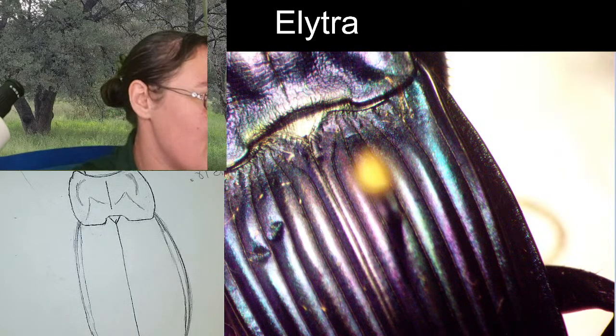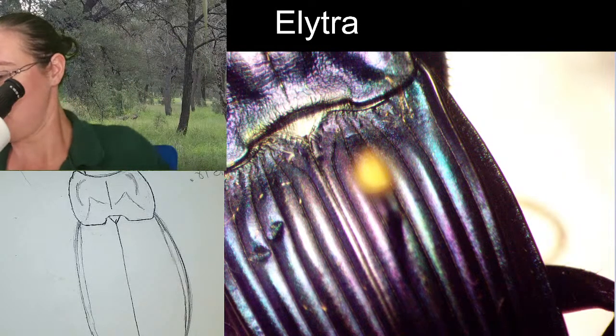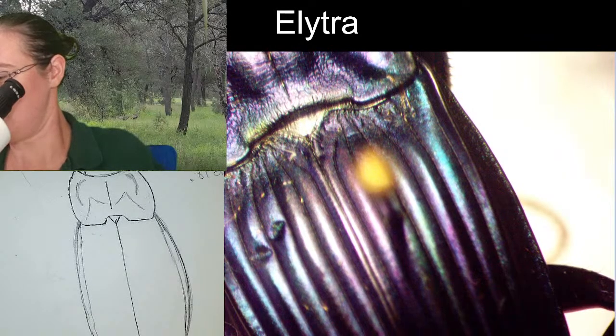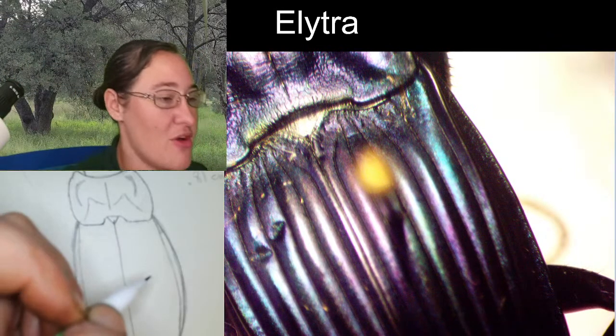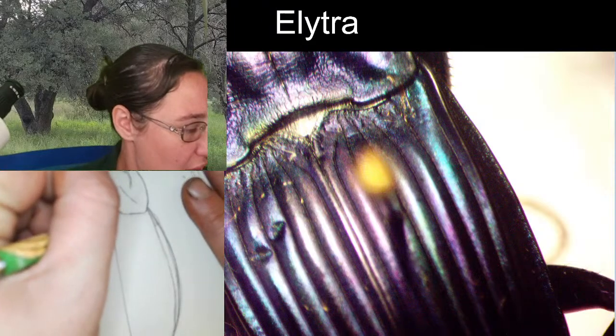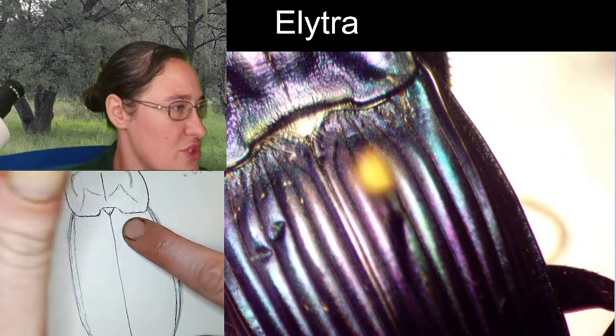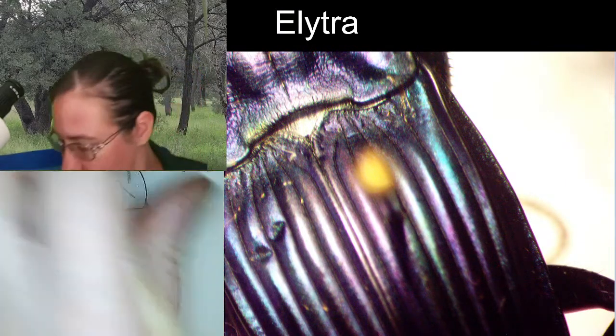All right, let's see. We've got 1, 2, 3, 4, 5, 6. There are 6 striations per elytron. All right, so there are 6 striations going down. If you'd like your sketch to be realistic, we've got the 2 in the center, the 2 closest to the edge actually meet together, so they come like this. There's 1 that comes all the way down.